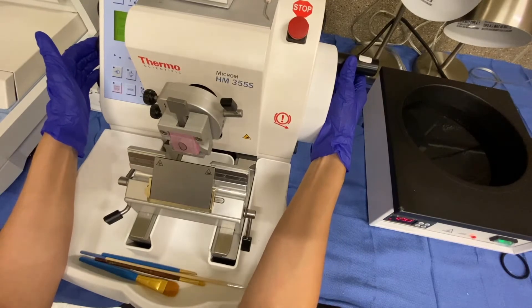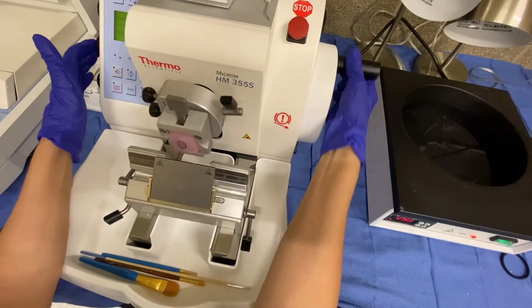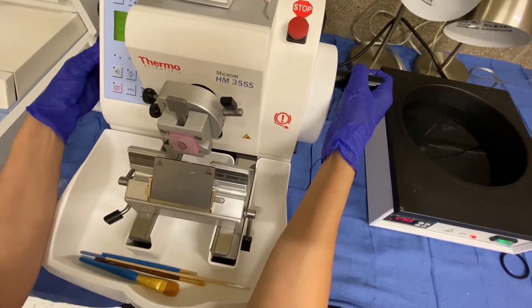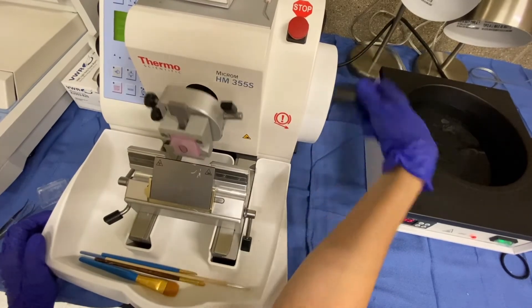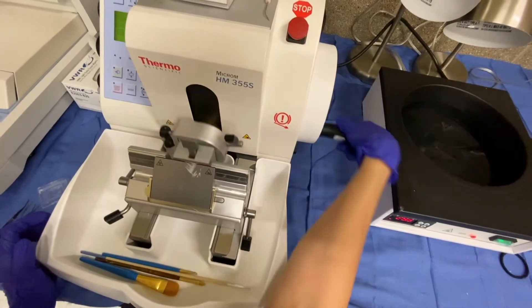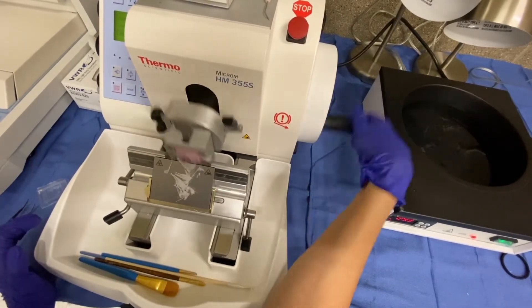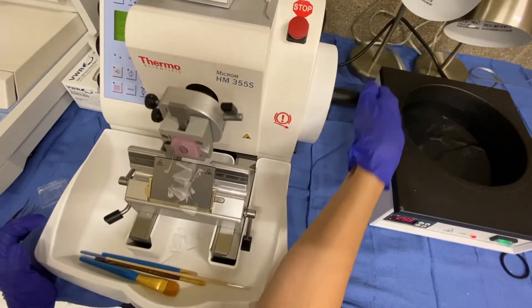One thing you can do is tap this machine and it actually brings it forward. So we'll wait until I get a little closer and just rotate it forward. Once your block comes into contact with the blade, you no longer want to advance the block, because if you start pressing the button or rotating, you can start taking large chunks of tissue out of the block and you don't want to do that. So I'm starting to face the block.